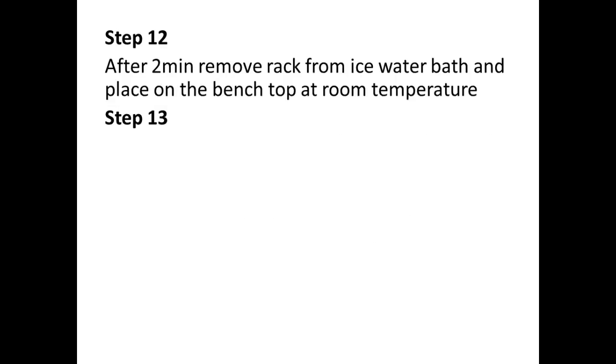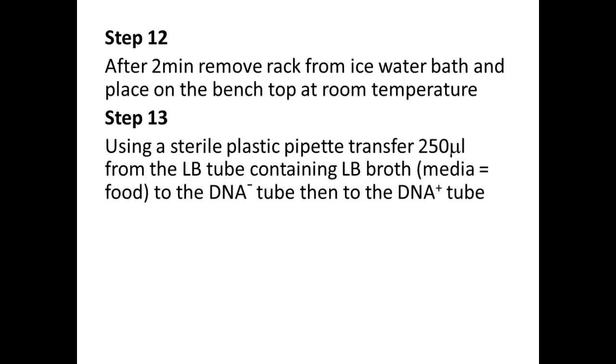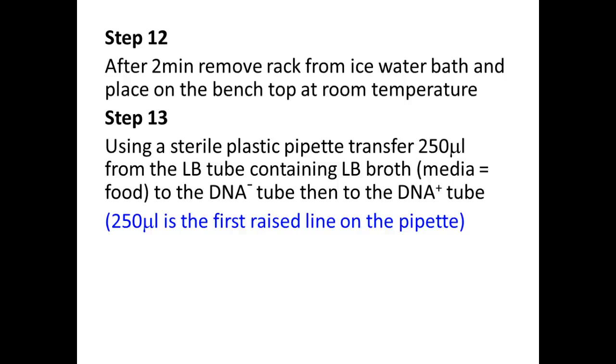So step 12, after 2 minutes, we're going to just remove the racks out of the ice bath and place them on our bench top at room temperature. Then I'm going to give you a tube that contains LB. This is just a broth media, food for your bacteria. And you're going to transfer that into both of your tubes. So you're going to feed both your organisms, right?